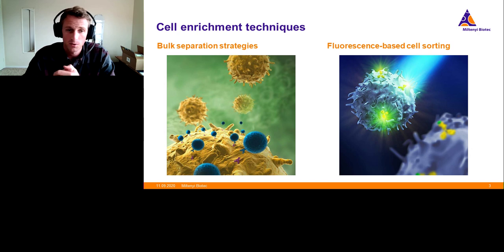So that makes it really quite difficult to scale that into something that is approachable for a new operator in this environment, because the list of requirements to feel protected with an aerosol generating system is a long one, and it's one that requires quite a bit of expertise to feel ready for. So I'll go into a little bit more detail on what that requirement is, but I think what we are going to be really focusing on today is not so much these bulk separation strategies. I think these are well conserved.